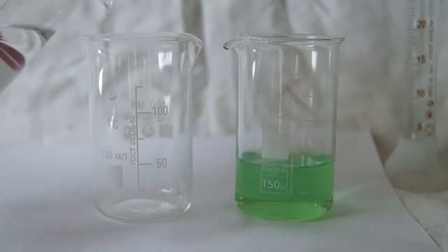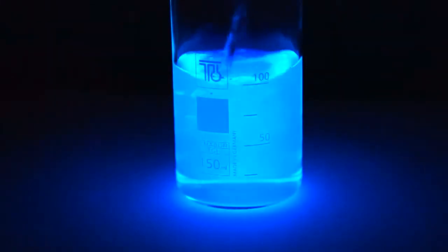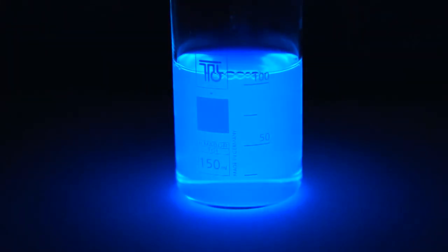Now we will conduct the reaction itself. Take 15 milliliters of each solution, turn off the lights, and merge them together. As you can see, a very beautiful glow occurs. Luminol emits light for a few seconds.